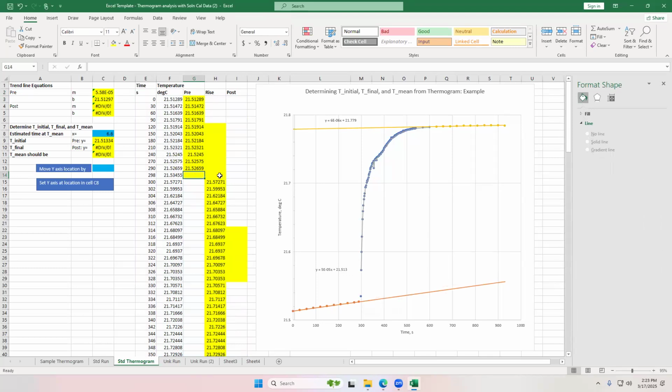Okay, and probably add the 298 over here, right there. I can even add the 290 over here as well, just so it's complete. Okay. So now what do I do? I need to move my axis, right? Oh, I need to change my slope and intercept now.